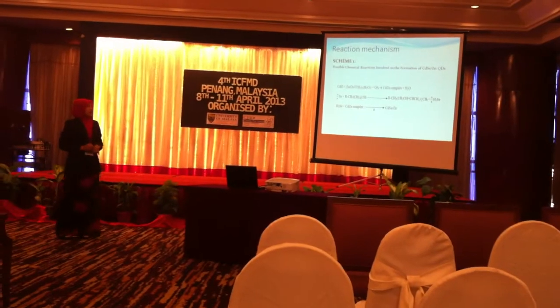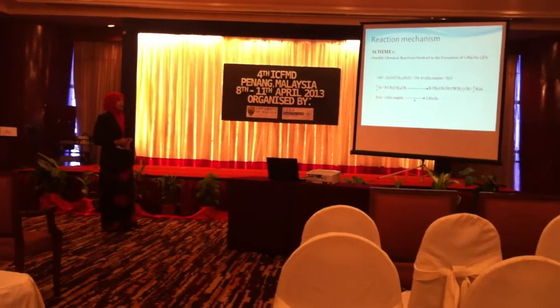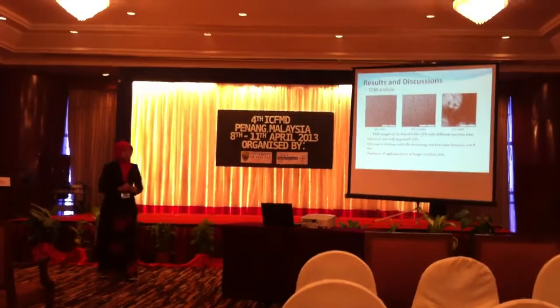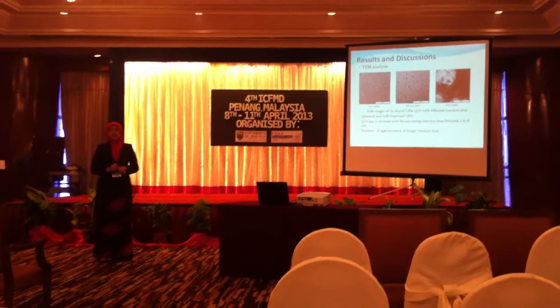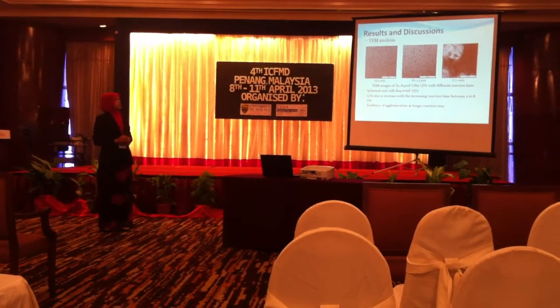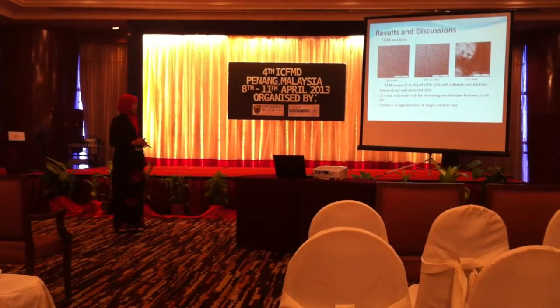Okay, this is the reaction mechanism I propose in my project to produce zinc cadmium selenide. Okay, the most attractive part is the result and discussion. The first result from my research project is TEM analysis. So I put here 3 different reaction times.